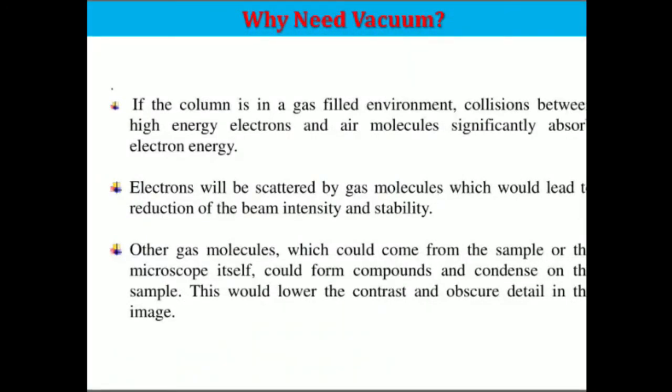Another fundamental requirement for TEM is that high vacuum is required. If the column is in a gas filled environment, the collision between high energy electrons and air molecules significantly absorbs electron energy, and the electrons will be scattered by gas molecules, which leads to the reduction of the beam intensity and stability of the electron beam. Other gas molecules, which could come from the sample or the microscope itself, will form a compound and condense on the sample, which will destroy the sample, and the image is not in perfect form.